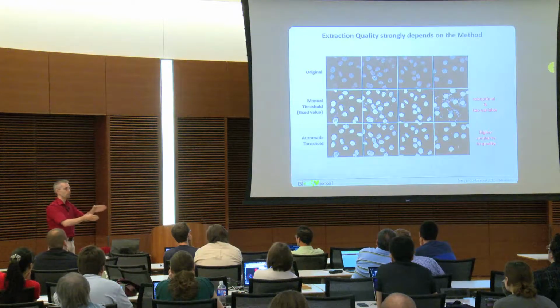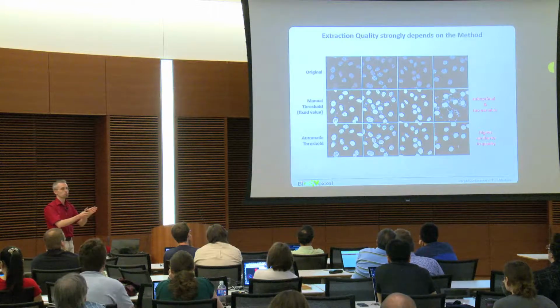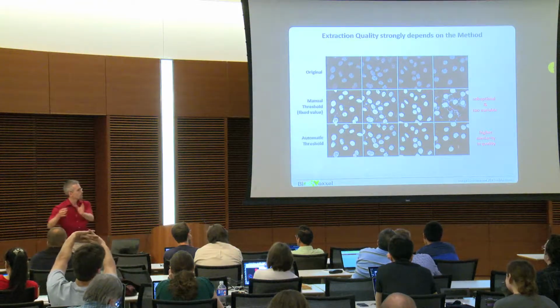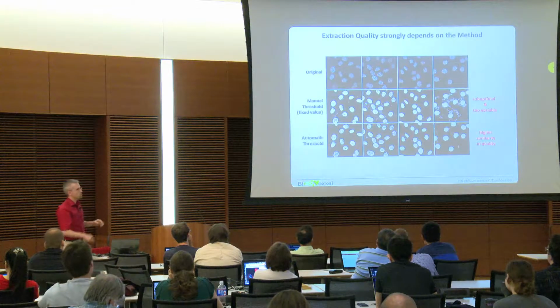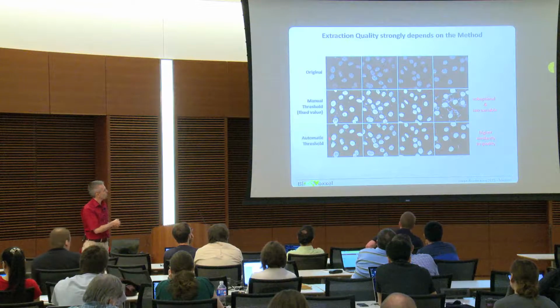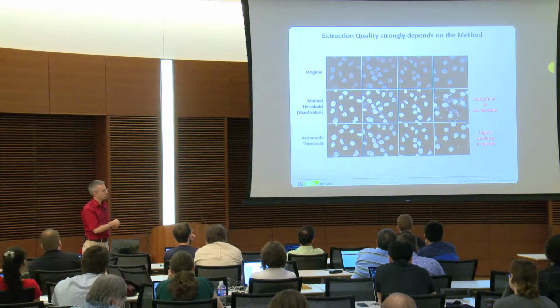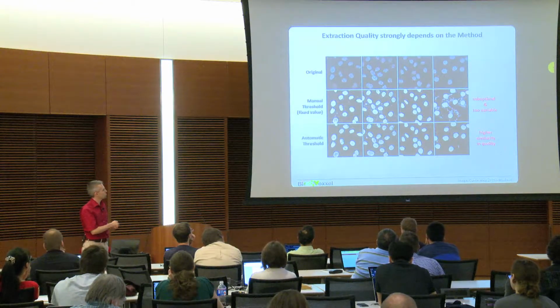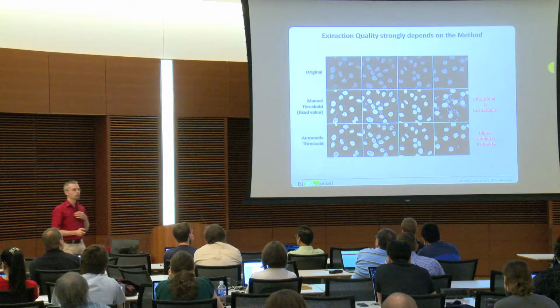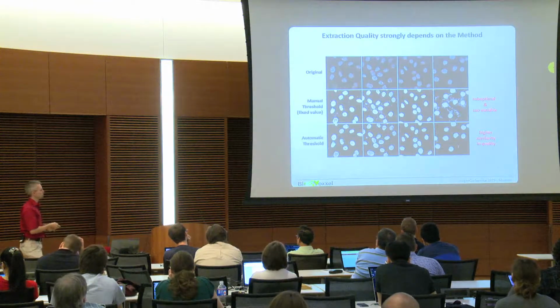So the absolute cutoff value is different for the images, but it's comparable because you use the same algorithm. So you need to use the same auto threshold for all these images, but then it's comparable. What you get here is that you still have the holes. We deal with those later on; you will see functions which do that. But the background level is very similar everywhere, so the extraction is slightly better.